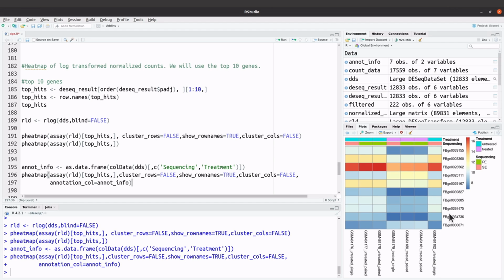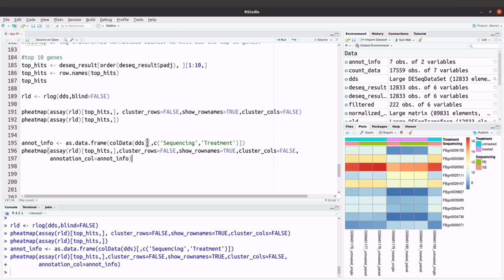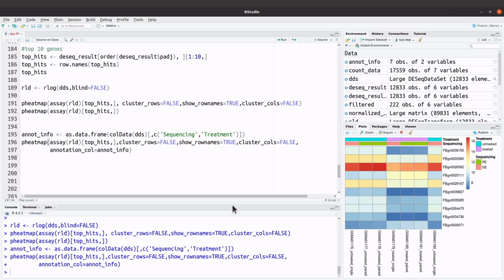Okay, so this gives some color, and you can use that color to identify the various groups, or, let's say, to identify each sample and then the group that sample belongs to. So that is what we have here. So you can try again, and this time enable clustering. So that is also possible. Now let's continue.